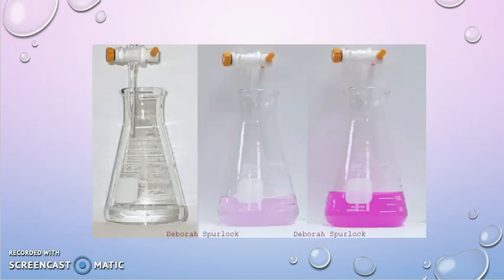Just wanted to show you this one more time. So this is what your analyte will tend to look like during the course of a titration. When it's clear, you aren't quite done with your titration. It's still mostly acid, and we haven't hit a neutral pH yet. All the way over on the right-hand side of the screen, if you go bright magenta, it's way overdone. Now what you mostly have in your container is base, and that's also not good.